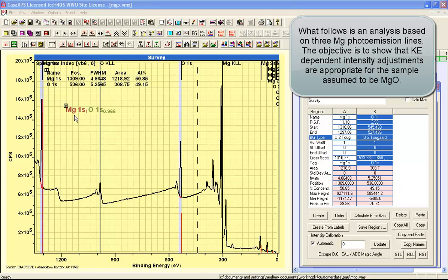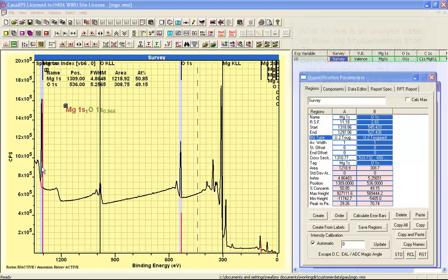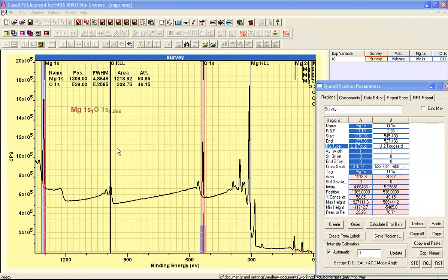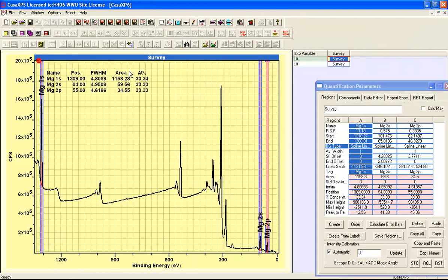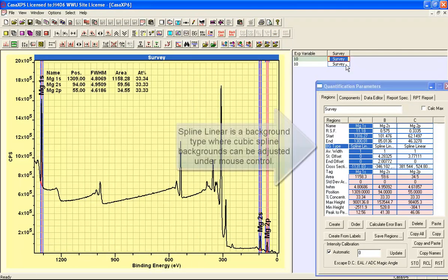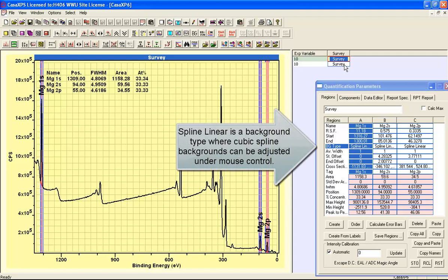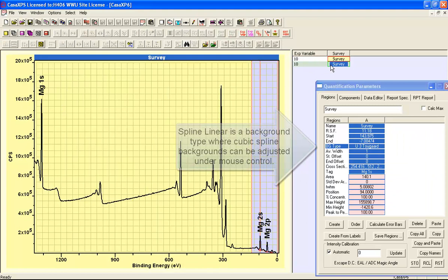Because if we can't demonstrate that this magnesium 1s is in the right proportion to these other magnesium peaks, it would be difficult to trust the quantification from the oxygen with this 1s. To investigate these magnesium peaks, I've created a file where I've copied the survey spectrum twice, and on these two survey spectra I've created regions.